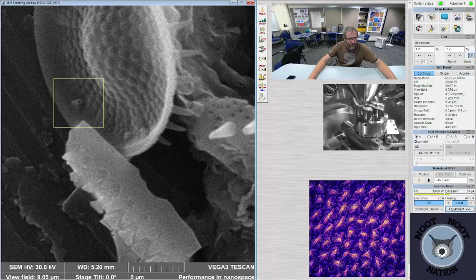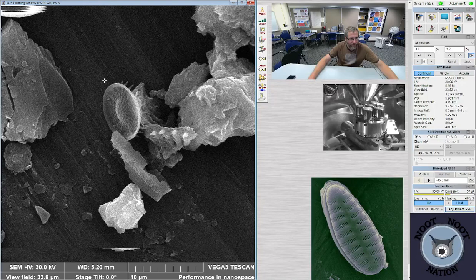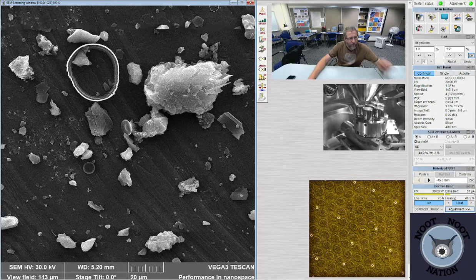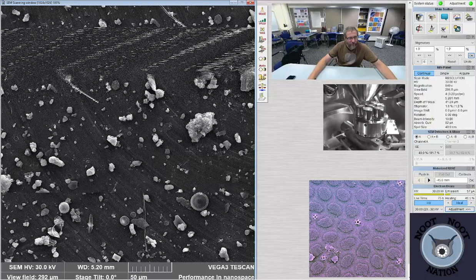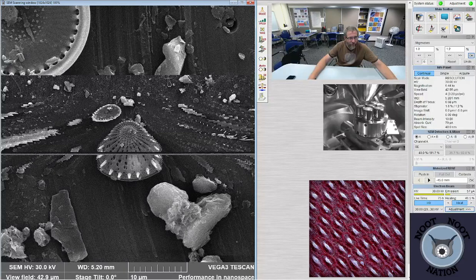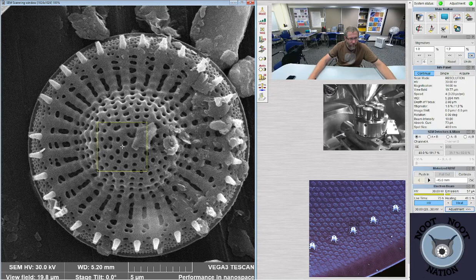Really, we're just trying to see what kind of Stephanodiscus we have. That does not look like, that just looks like Stephanodiscus minutulus or parvus to me. But we're looking for something that the student thought was potentially Cyclostephanos. So it's going to be one of these round guys, probably in the range of this one. Lots of Stephanodiscus. Pretty sure that's just Stephanodiscus.